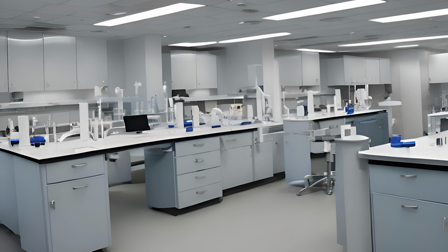To identify hazards in your clinical lab, look for things under the categories of biological, chemical, radiation, electrical, and fire. Not every medical lab is going to have radiation hazards. Primarily, that's a blood banking thing where radiation is used to kill rapidly dividing cells before a unit of blood is transfused to an immunocompromised person. Most other areas of the lab will not have to worry about radiation safety. That is primarily for blood banking. These hazards must be identified and labeled, and work practices must be developed for dealing with them. They cannot just be left ambiguous.